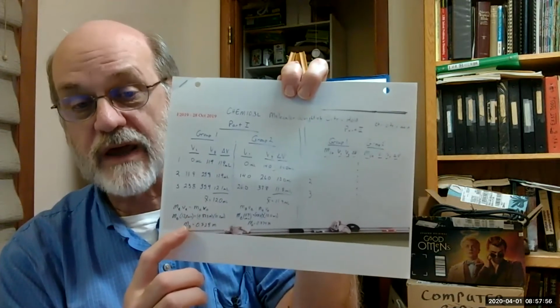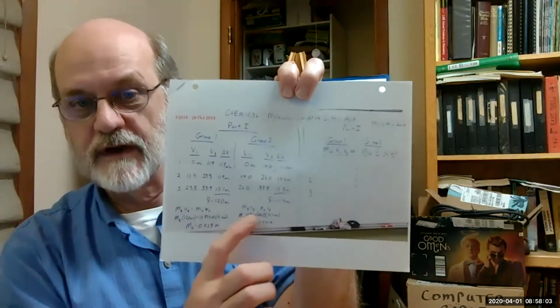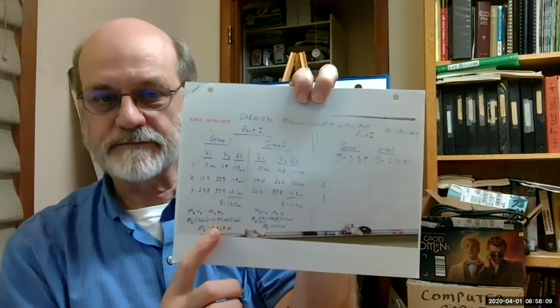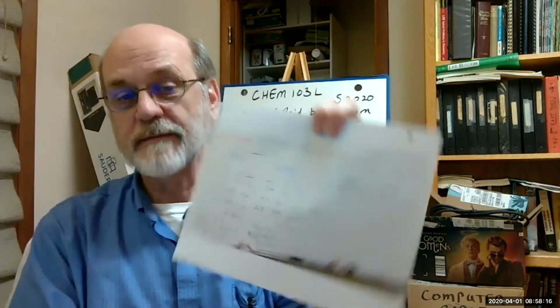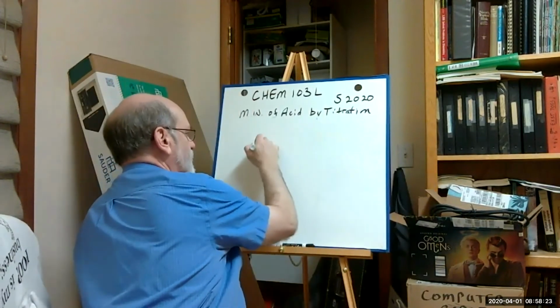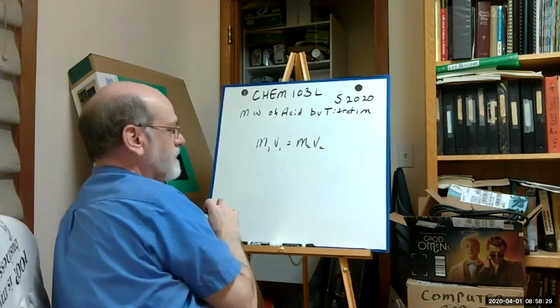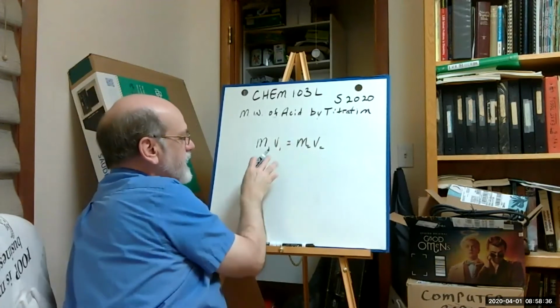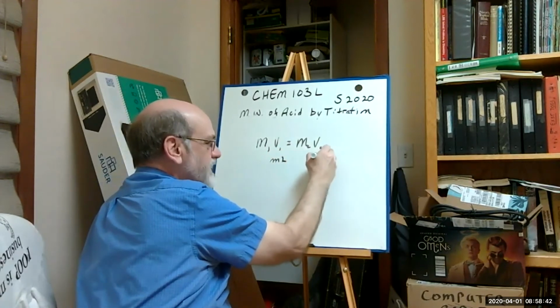This shows the calculation of molarity for the base, right? We have to standardize the base. That's what it's called. We standardize the base against a known acid, which was acetic acid, and its concentration. And it uses the same formula that I gave you just a few minutes ago. What you'll also notice is that with that formula, just a generic, this side is equal to that side, and if the volumes are in milliliters on one side, they have to be in milliliters on the other side.